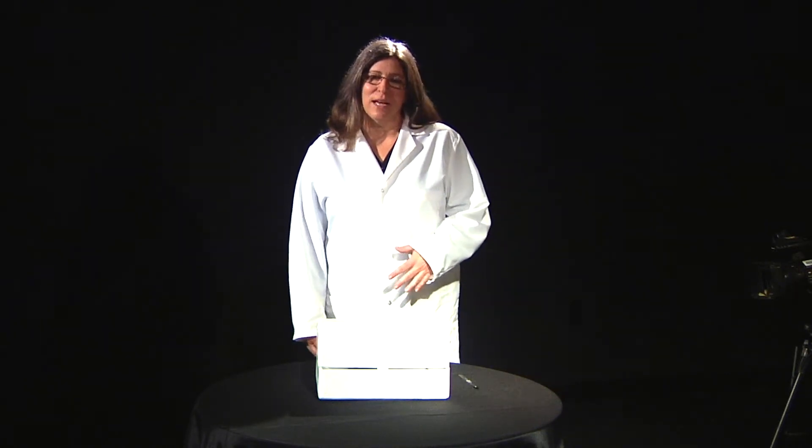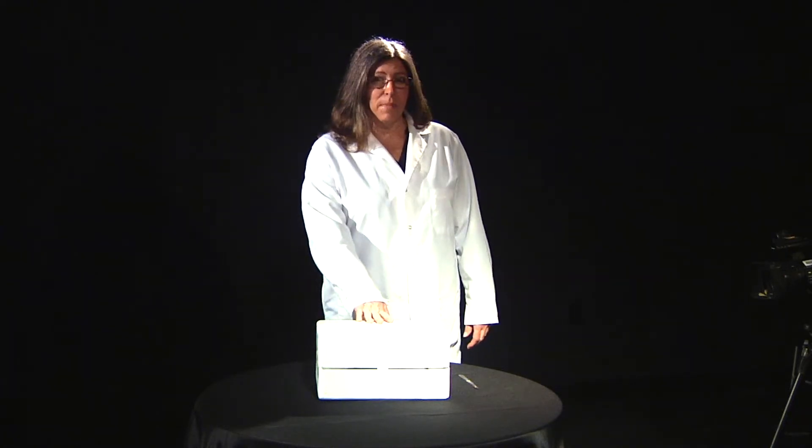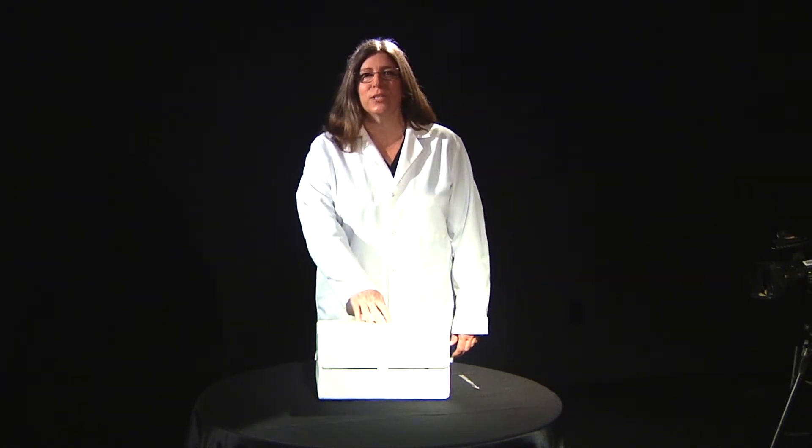Hi, my name is Dr. Randi Papke, and I am a professor of biology here at Southwestern Illinois College. Today I'm going to teach you how to unpack your microscope that comes with your Biology 100 lab kit.